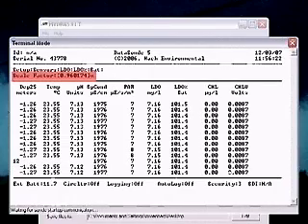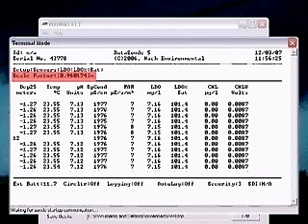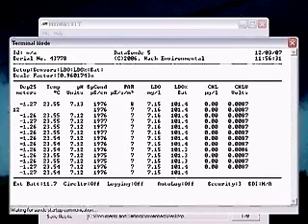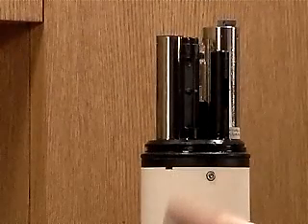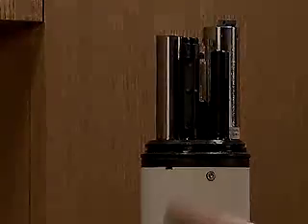Read the Scale Factor. A valid calibration will produce a scale factor between 0.5 and 1.5. Values outside of these parameters may indicate a problem with the sensor or electronics. Do not type a new value for the scale factor, as this will invalidate the calibration and cause the sensor to take incorrect readings. Press Escape after you have verified the scale factor is acceptable. Your LDO is now calibrated and ready to deploy.